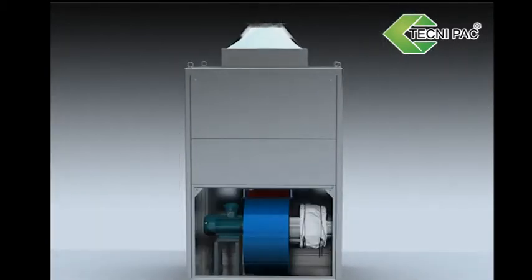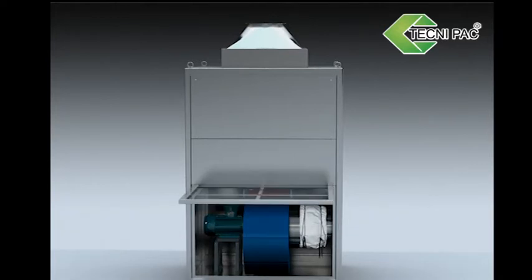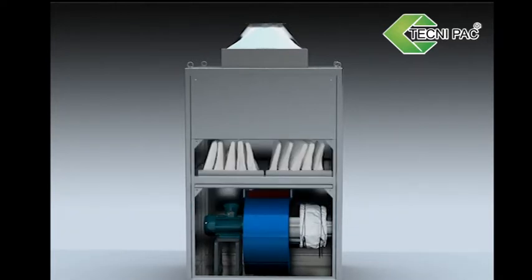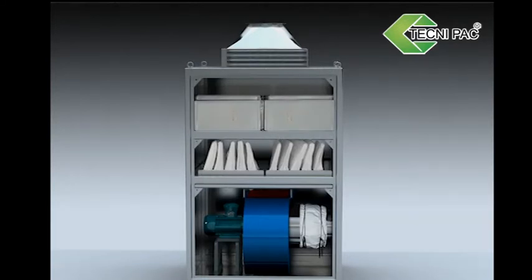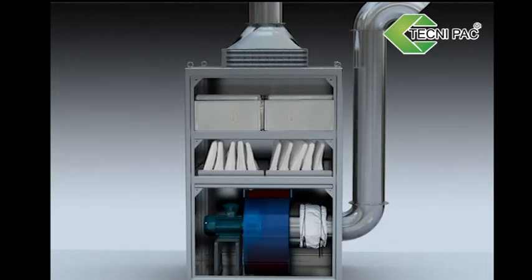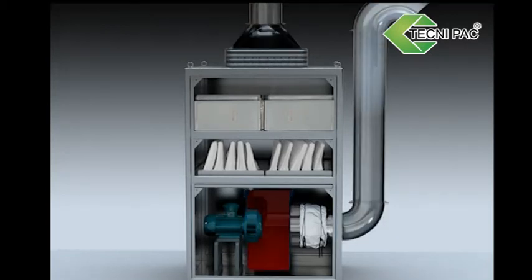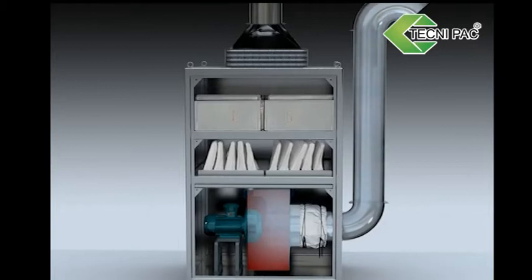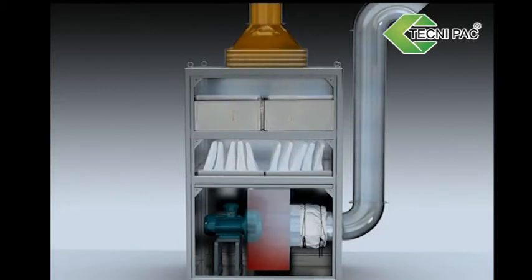Hot Air Cabinet. It mainly consists of centrifugal fan, primary effect, intermediate effect and high effect filters, and heat exchangers and stainless steel components. It can take natural air from outside and filter it after through primary effect, intermediate effect and high effect filters, and can reach 100,000 clean grade. The heated air preheats and dries the tablet cores through the stainless steel air pipe which is connected to the main machine.